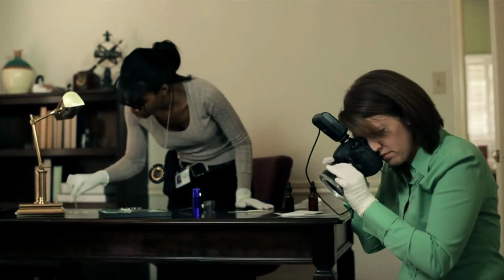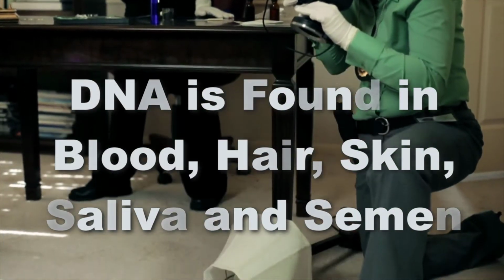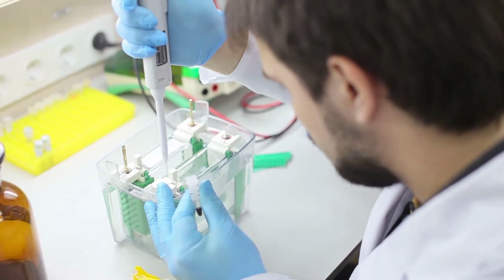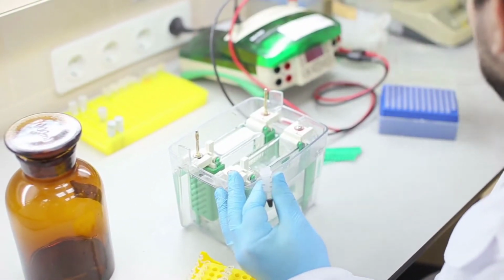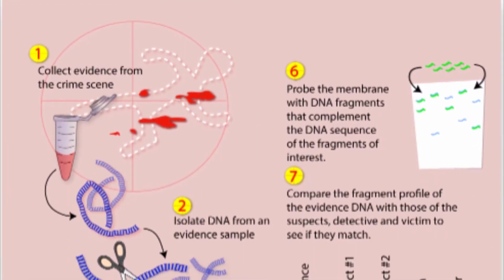DNA is often left behind at a crime scene. It is present in all kinds of evidence, including blood, hair, skin, saliva, and semen. Scientists can analyze the DNA in evidence samples to see if it matches a suspect's DNA. Here, we can see how DNA evidence used to be collected and analyzed.